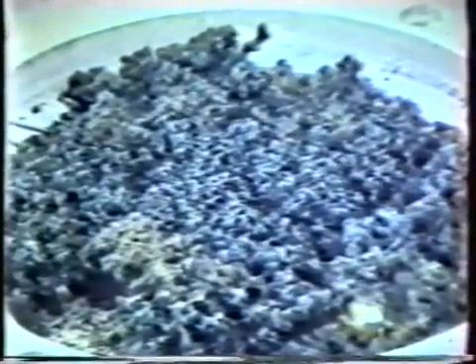The metal burns at a temperature of about 640 to 680 degrees centigrade, then cools down to about 560 degrees and continues to burn. The black oxide material you see here is actually a mixture of oxide and metal which will continue to oxidize over the period of the burn.